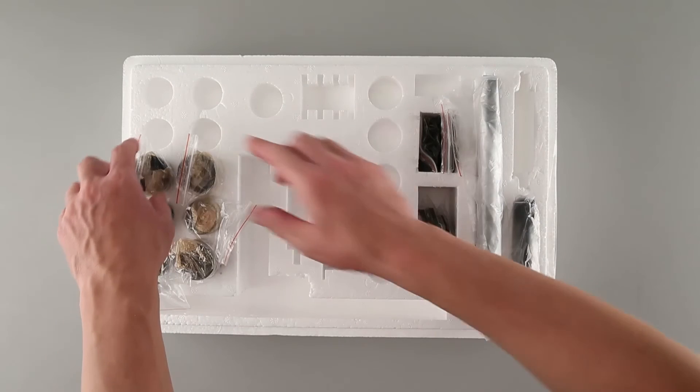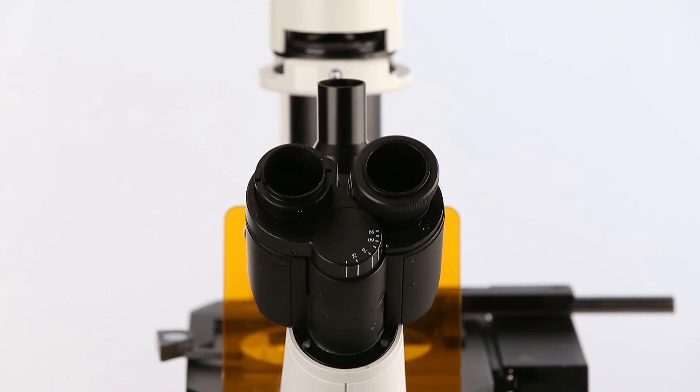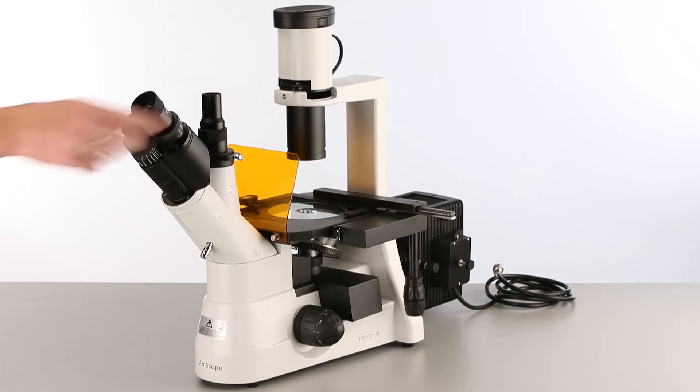Now we'll install a pair of eyepieces. We'll start by removing the dust caps. Each eyepiece is inserted into an ocular housing on the head of the microscope.